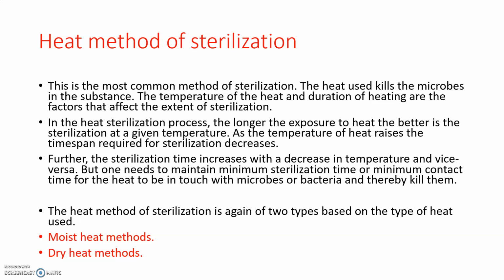In the heat sterilization process, the longer the exposure to heat, the better the sterilization at a given temperature. When the temperature of the heat rises, the time required for sterilization decreases. Further, the sterilization time increases with decrease in temperature and vice versa. But one needs to maintain a minimum sterilization time, or minimum contact time, for the heat to be in touch with microbes or bacteria and thereby kill them.